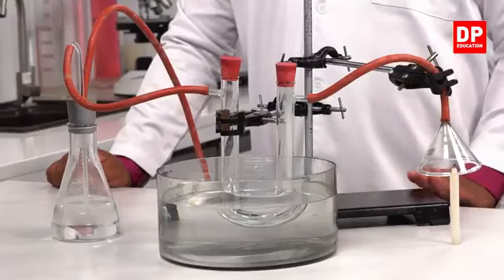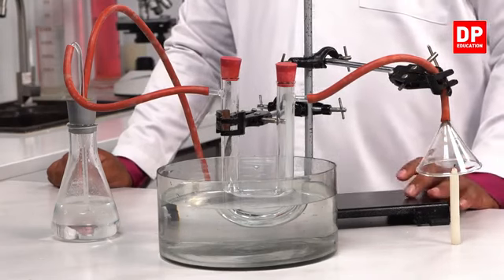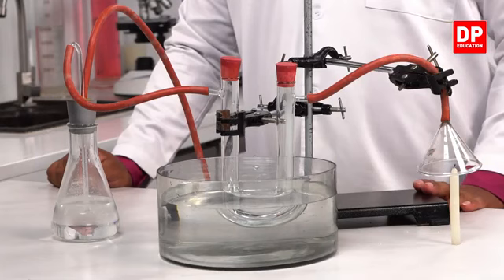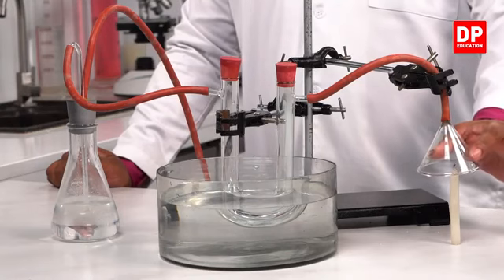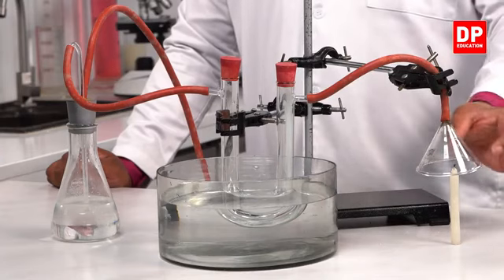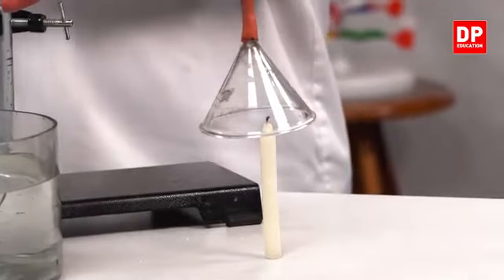First of all we'll need a stand. This stand is used to fix all the other materials firmly, as in this setup. Then we'll need a funnel. That funnel is used to direct the smoke which is emitted from the candle towards the system.